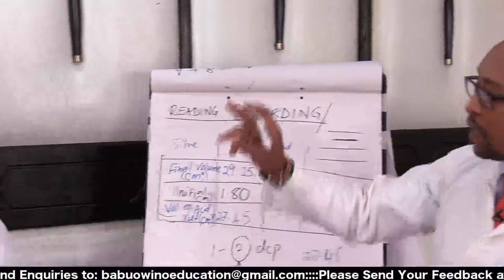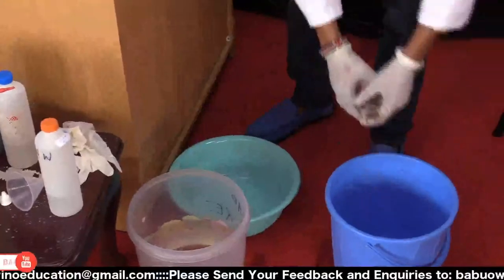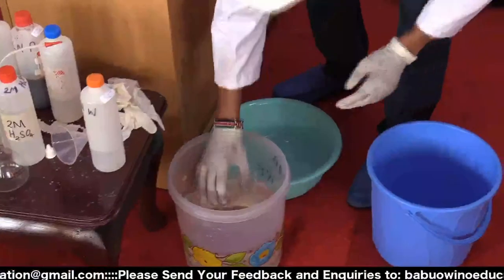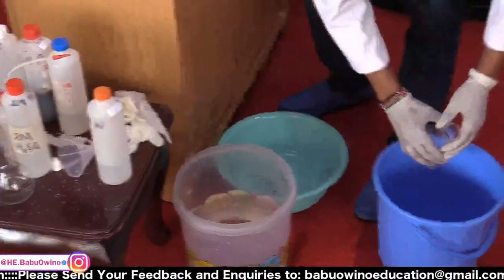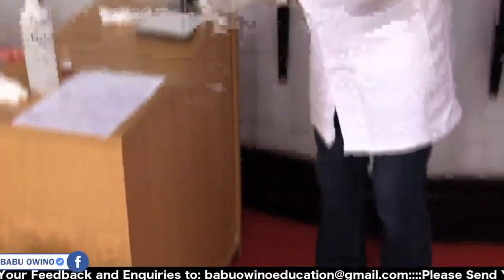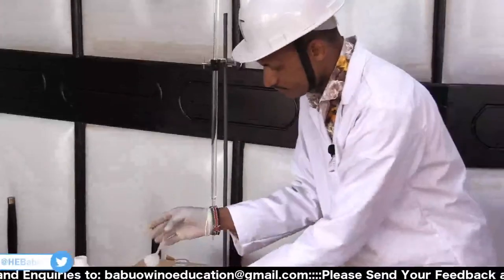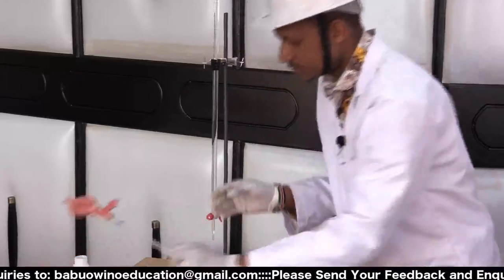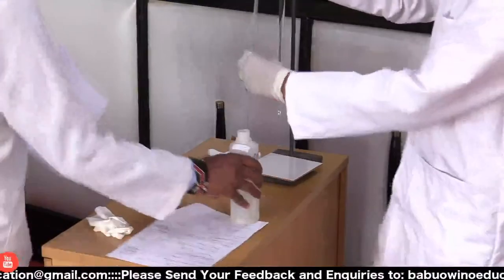So we again allow what Mheshimiwa will give me. Do away with the first solution, and then you rinse. Rinse your conical flask. Then again, use your pipette. Get another solution of sodium carbonate.